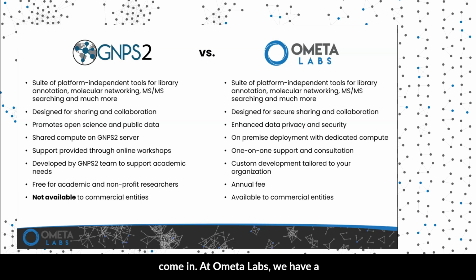So that's where we come in as Ometa Labs. We have a platform that is very similar to GNPS. So if you're an academic in this workshop, don't worry, the stuff that we'll be showing to you today is still applicable if you want to use GNPS. However, we have designed our platform for more secure sharing and collaboration. We've enhanced the data privacy and security.